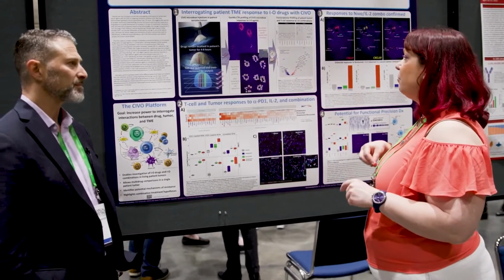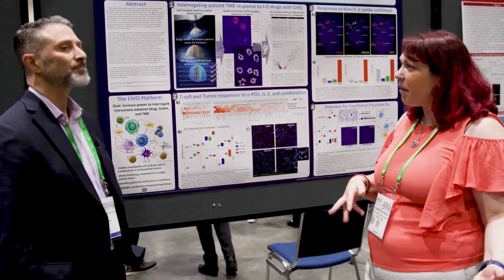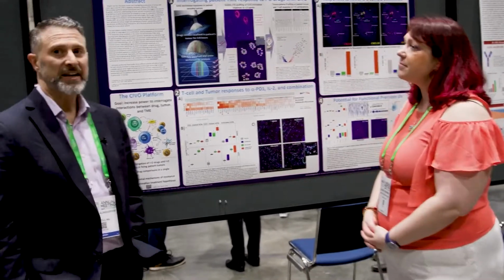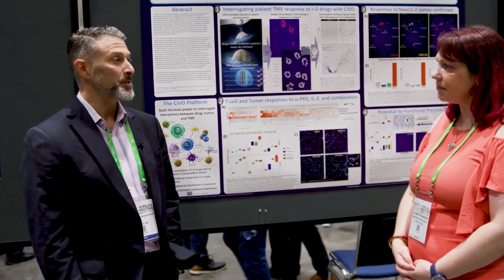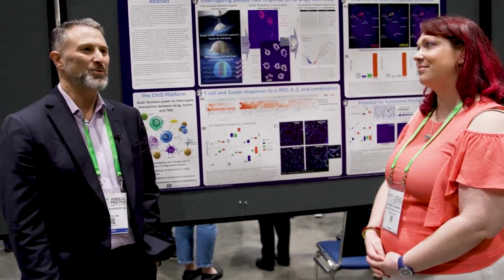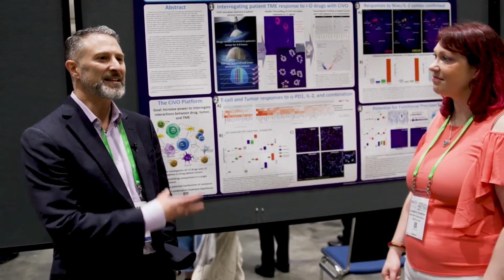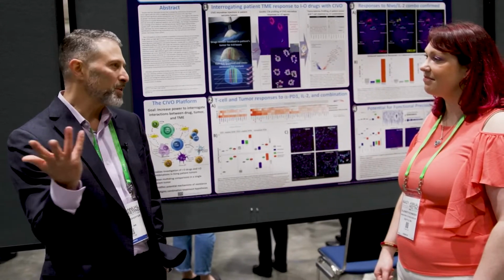Obviously you're doing RNA, did you use the Whole Transcriptome Atlas, did you use something else? For this study, we used the Cancer Transcriptome Atlas. That's been our workhorse thus far. We have started using Whole Transcriptome Atlas as well, but mainly we use Cancer Transcriptome Atlas because it has all our pathways, and we really like the fact that you have a nice probe set with multiple probes for different genes.